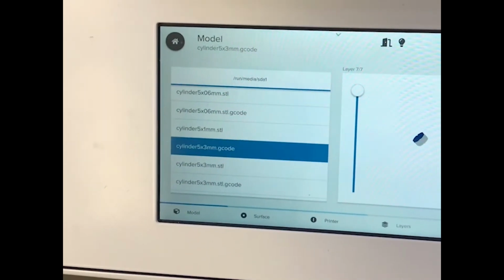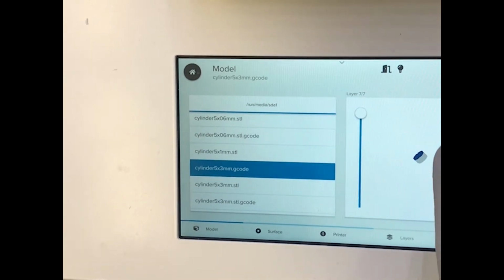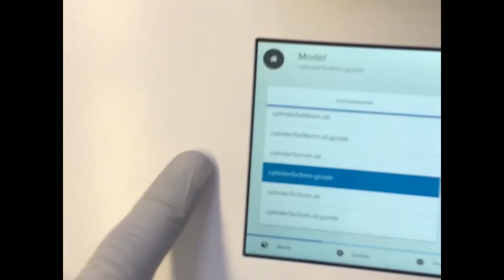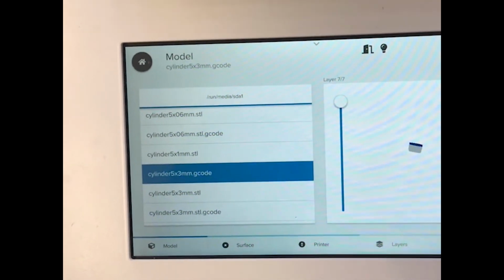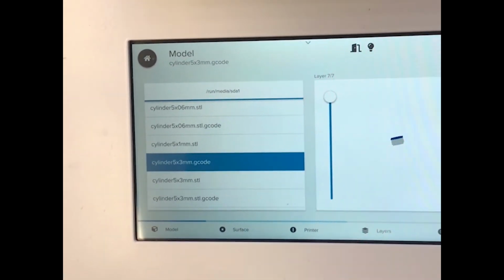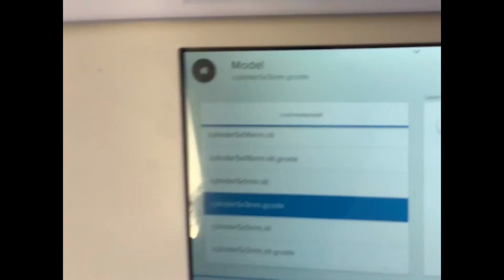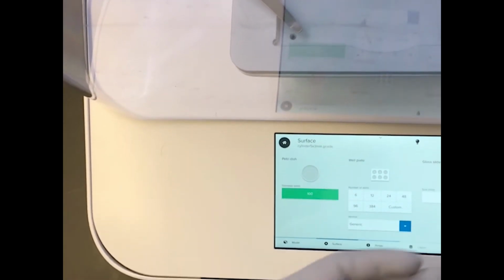from here you can pick what you're going to print. Here I've already picked the cylinder, radius 5 by 3 millimeters tall. As you can see, this is what it's supposed to look like here on the preview. I'm just going to close this real quick. Sorry about that. And then for the surface, I closed it too early. It's the surface that it's going to print on. We're going to do it on a 10 centimeter dish.